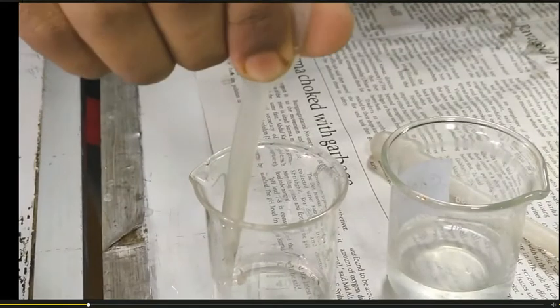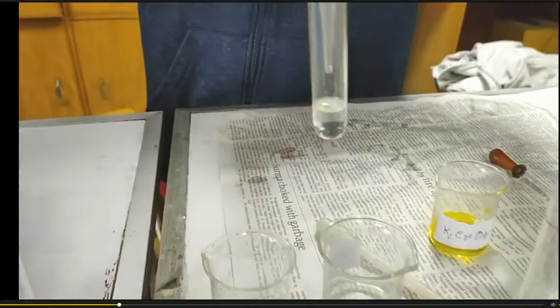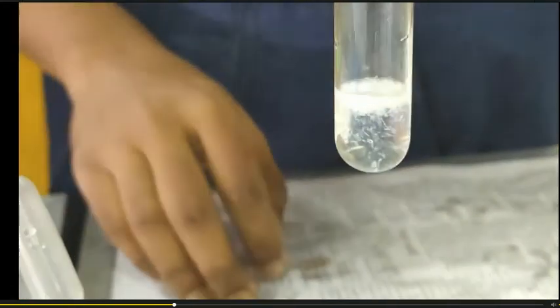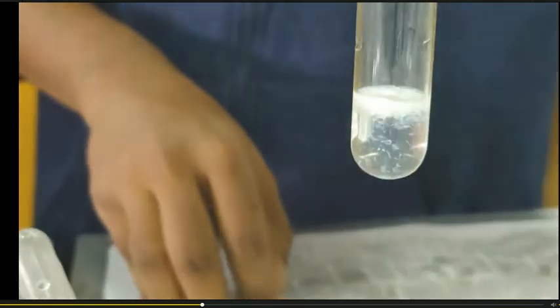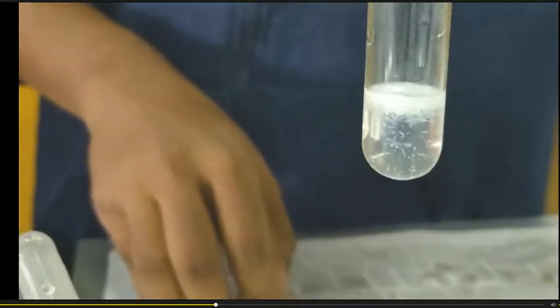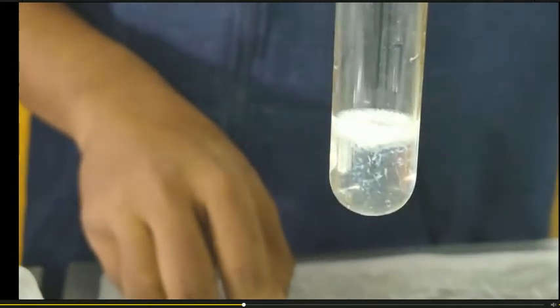This will produce a white PPT. This is indicative of the presence of calcium cation. Calcium has formed calcium carbonate and appeared as a PPT. This is all about the test of calcium.